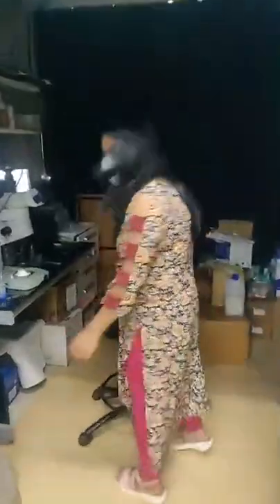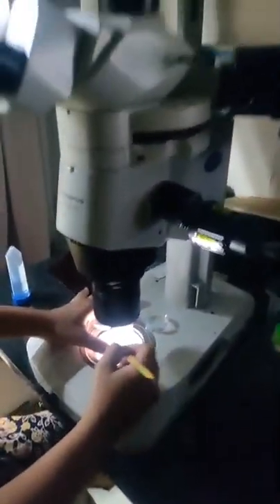Great. So, like you saw, the fish over here are adult zebrafish, which we use as our model organism. And we basically look at the young fish, which are babies of these adult fish. If you come here, I'll show you. It is a microscope that helps us visualize the fish at some magnification. This is a fish that is freely swimming, and if I give it some stimulus, it will execute some movement. You see that? Wow.